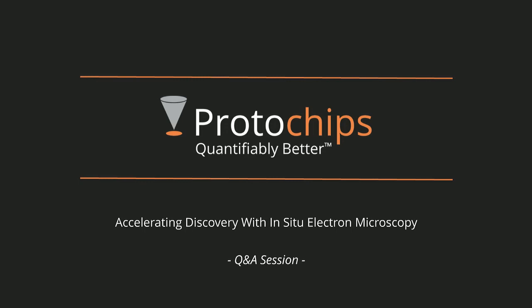So for, say, for example, microchip heating devices that have some kind of calibration from cameras that Jordan just mentioned, we want to be able to confirm them for ourselves. So that's why my colleague Juan Carlos Idrobo took the initiative to understand temperature measurements at the nanoscale, using a nanoscale probe with EELS measurements. We've shown that, I can't remember the slide number, but we have that documented in a PRL paper.